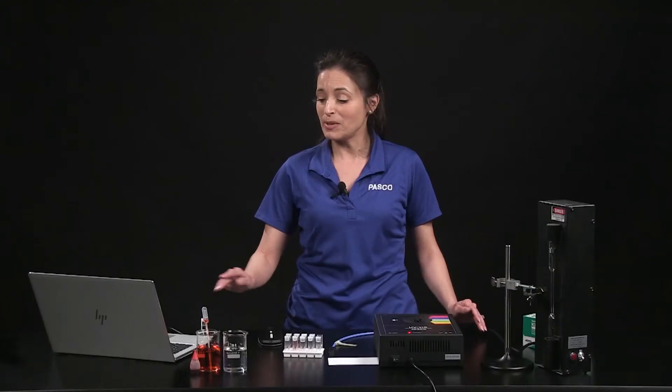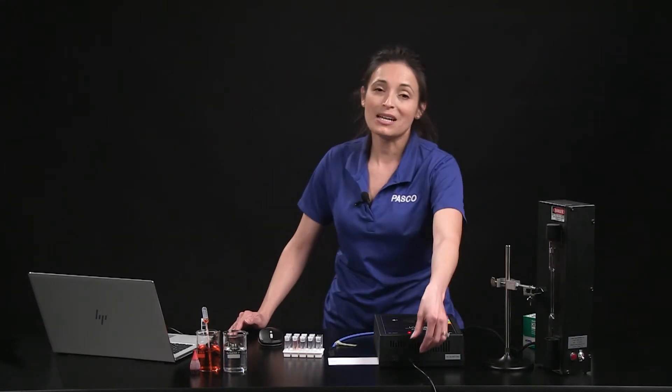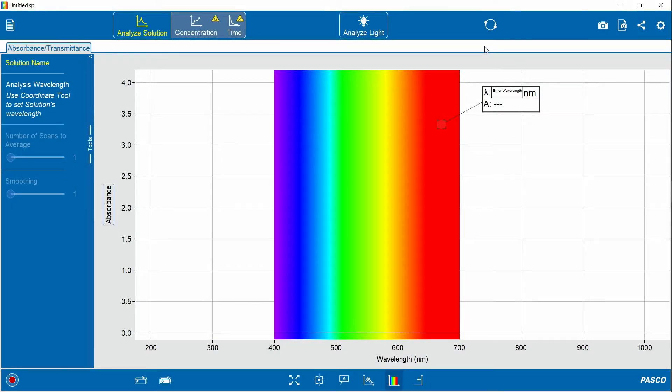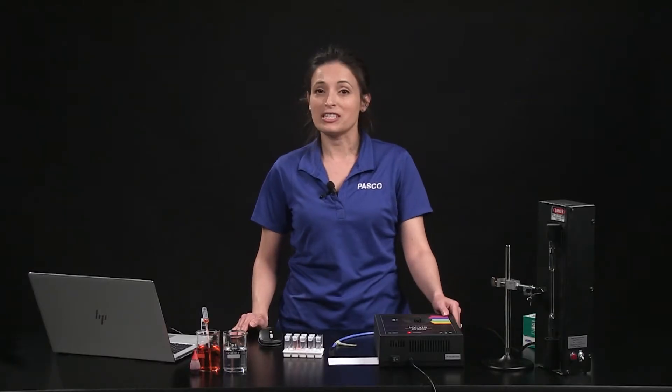The spectrometer connects via USB to your Windows or Mac computer. It comes with an AC adapter. You will need version 2.3 or newer of the free spectrometry app to use with the UV-VIS spectrometer.